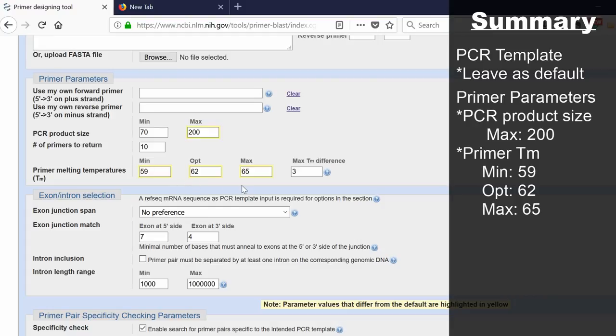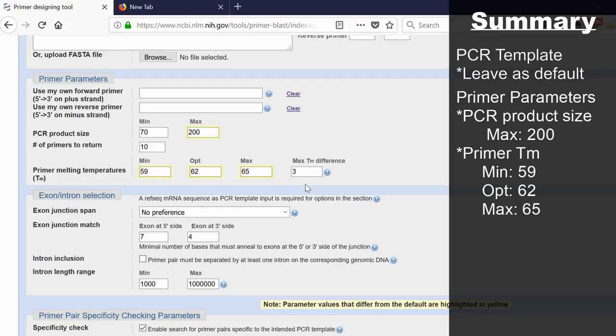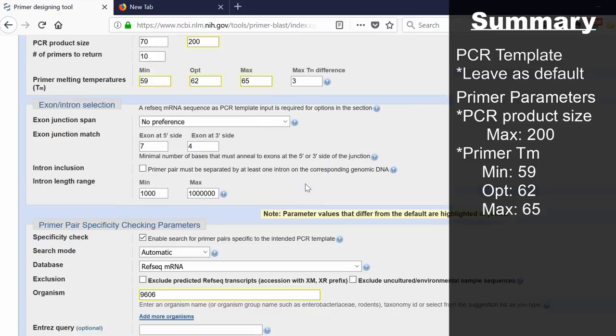Obviously, you won't actually know until you receive the primers what the optimal annealing temperature for that reaction is. At the end, it says max melting temperature difference. This is the difference between the forward and reverse primer. You want them to have very identical melting temperatures as close as possible. We're going to leave this set at 3 degrees.